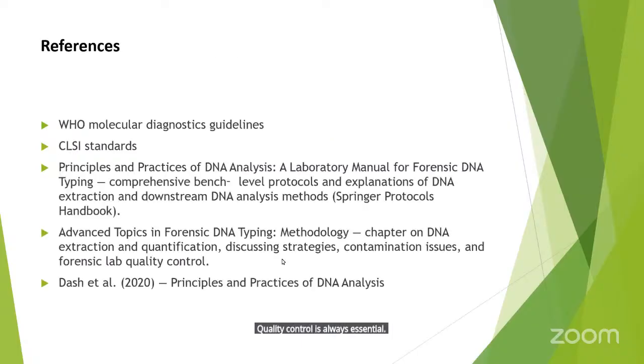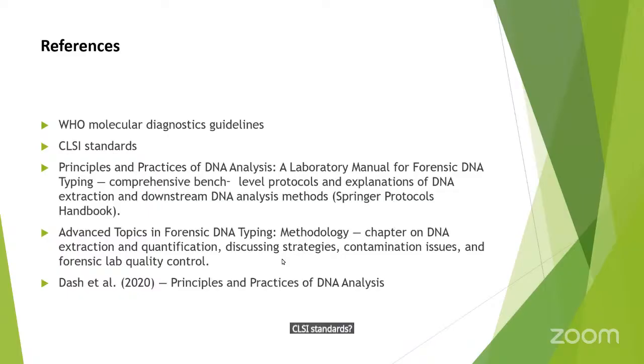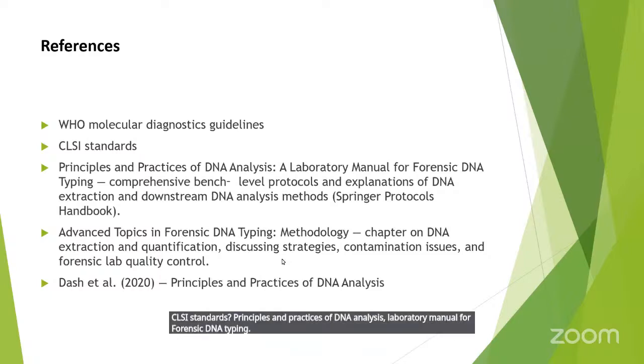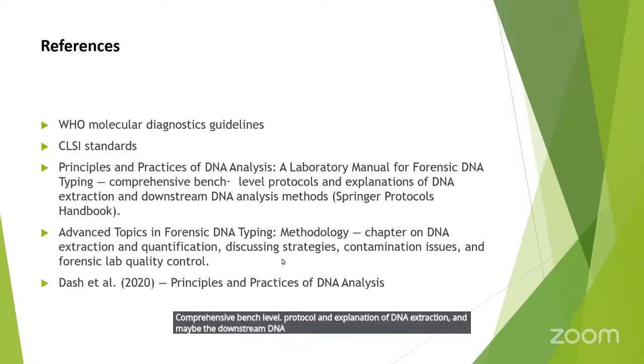So you can get our reference from the World Health Organization Molecular Diagnostic Guideline, CLSI standards, principles and practices of DNA analysis, laboratory manual for forensic DNA typing, comprehensive bench level protocol and explanation of DNA extraction, and maybe the downstream DNA analysis methods, Springer Protocol Handbook.